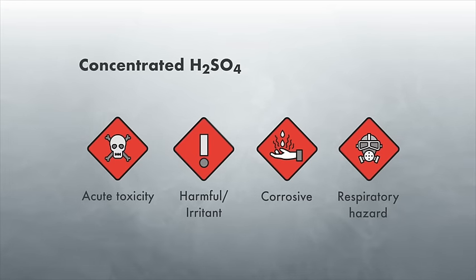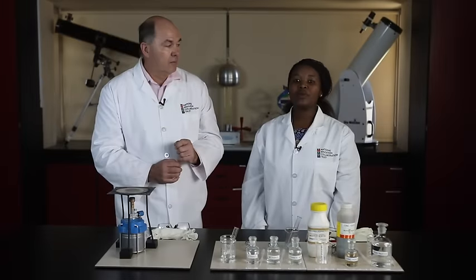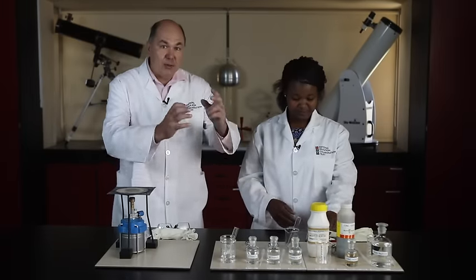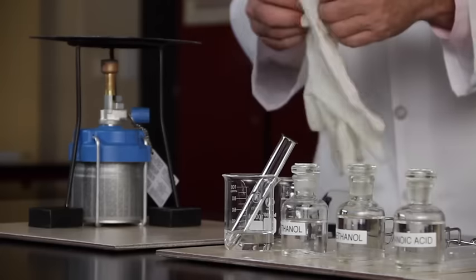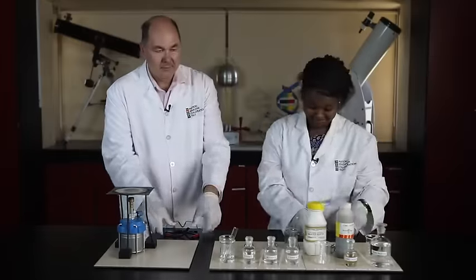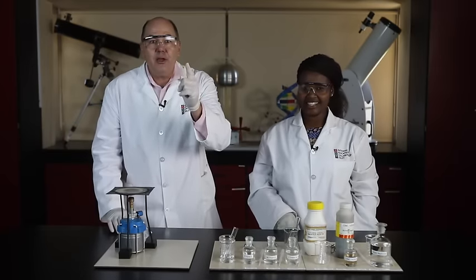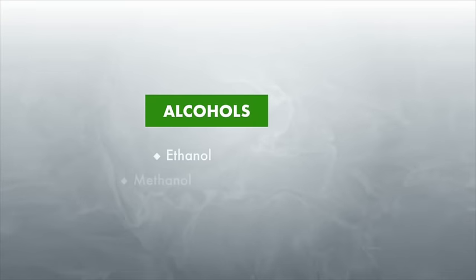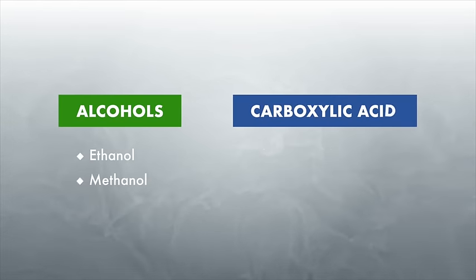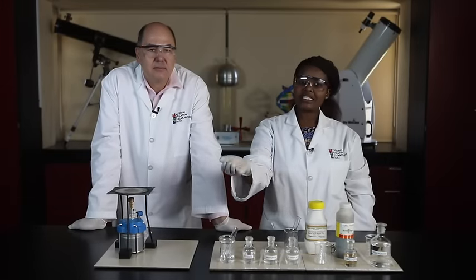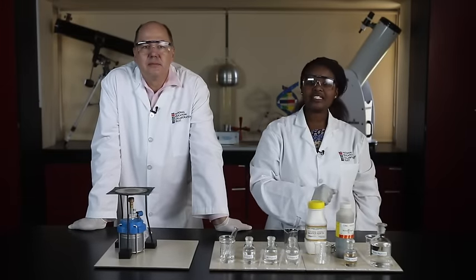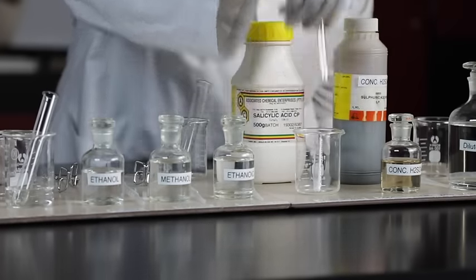We will wear gloves and safety goggles. Let's put those on now. As our carboxylic acid, as you can see, all of these substances are liquid except for salicylic acid, which is a crystalline solid.